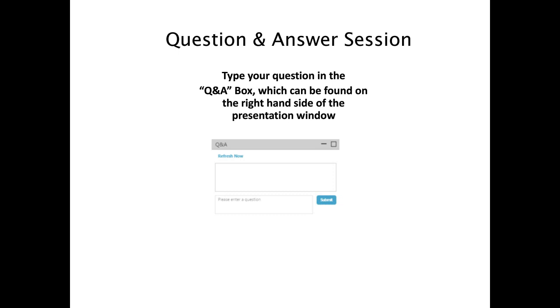incurred sample reproducibility? Yeah, there is some impact on the ISR, because what people are usually doing with ISR is that they are selecting a few samples which fall into certain concentration ranges within the analytical range, so something which is in the top 30% or the bottom 30%. And what happens here is that there's potentially the problem that you could enrich either biosimilar or innovator samples or signals from those samples into your ISR assessment in an unequal fashion.